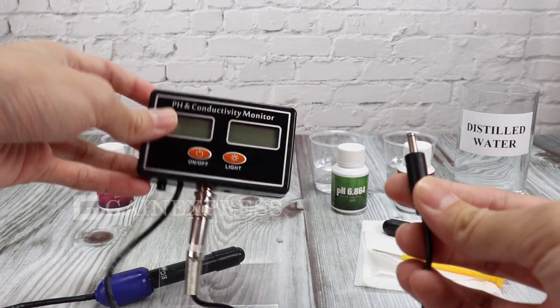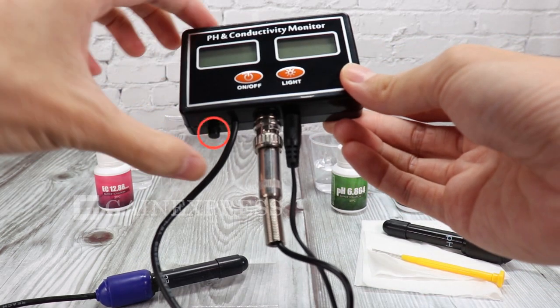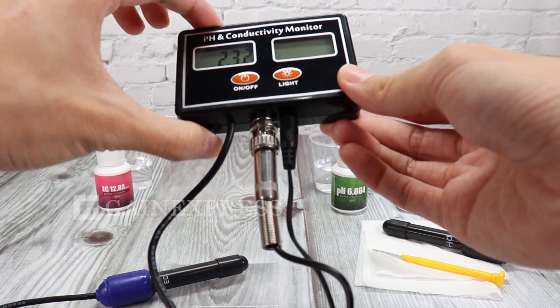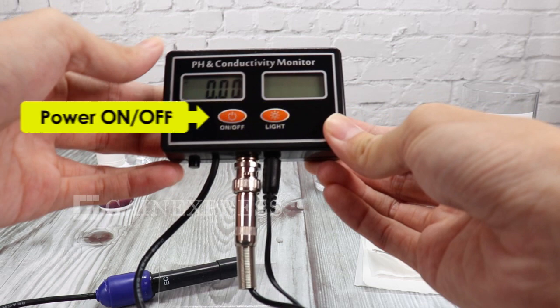To operate this meter, connect the power adapter to the meter and press the main switch at the bottom of the meter to open the self-locking switch. You can now use the power button to turn on and off the meter.